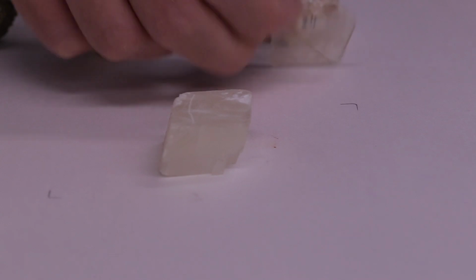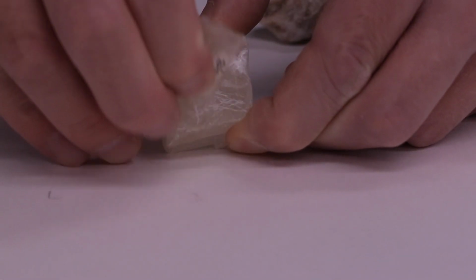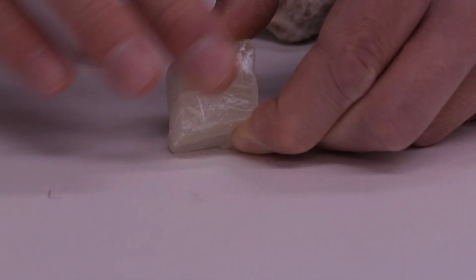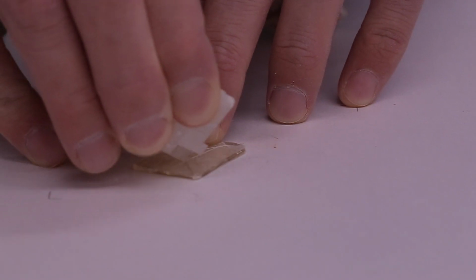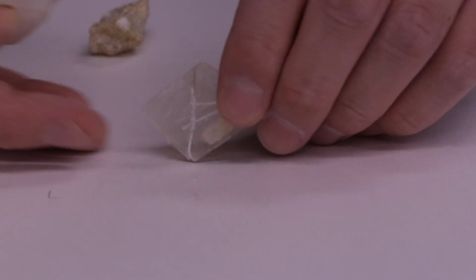So if I take gypsum, which is 2 on the hardness scale, and attempt to scratch the surface, well, it's leaving a material behind, but that material can easily be wiped away. It's not actually scratching the surface of the calcite. Conversely, if I take the calcite crystal and I scratch the gypsum, it's going to leave a permanent mark on the surface of the gypsum.